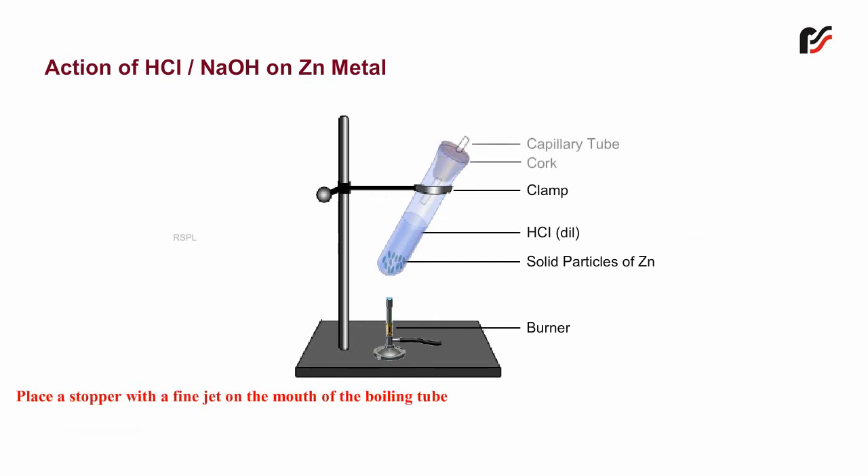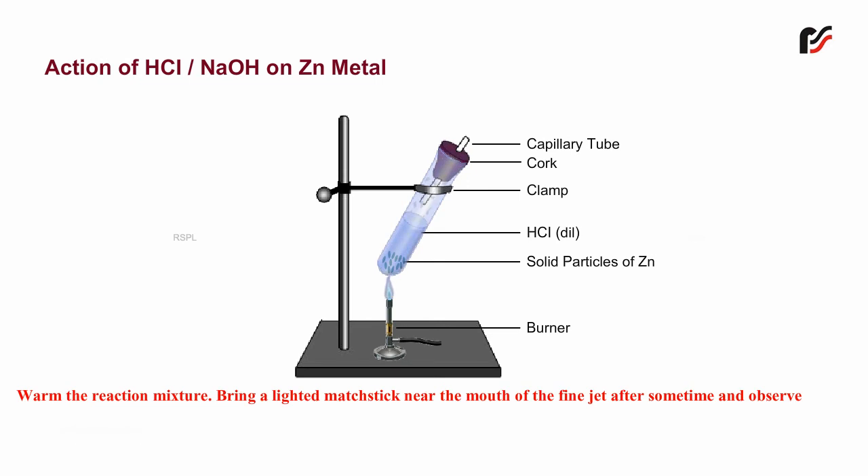Place a stopper with a fine jet on the mouth of the boiling tube. Warm the reaction mixture. Bring a lighted matchstick near the mouth of the fine jet after some time and observe.